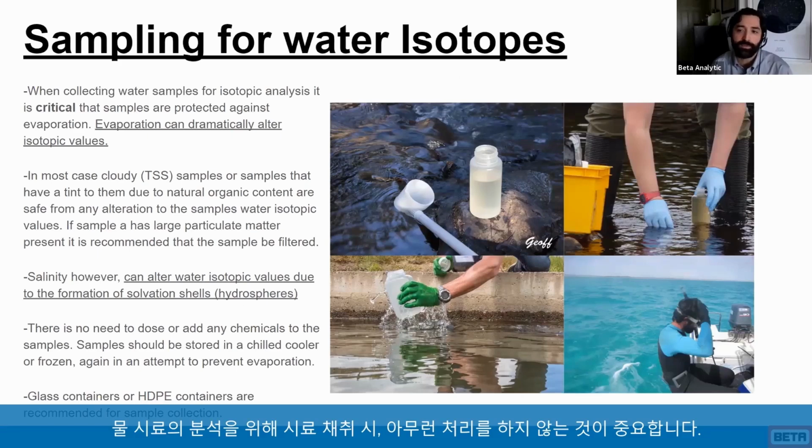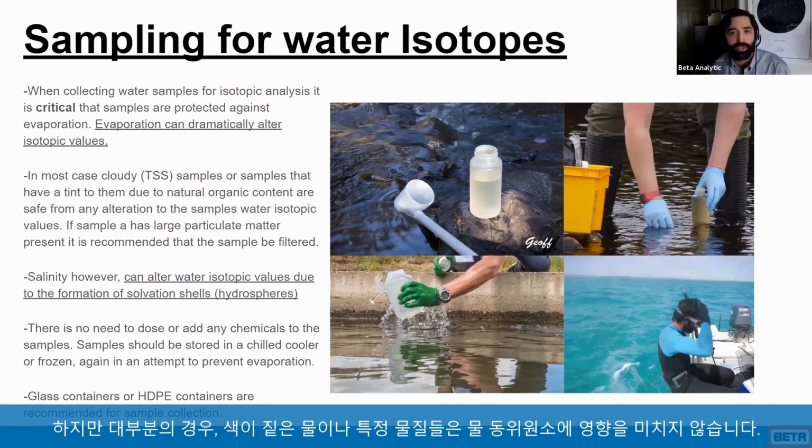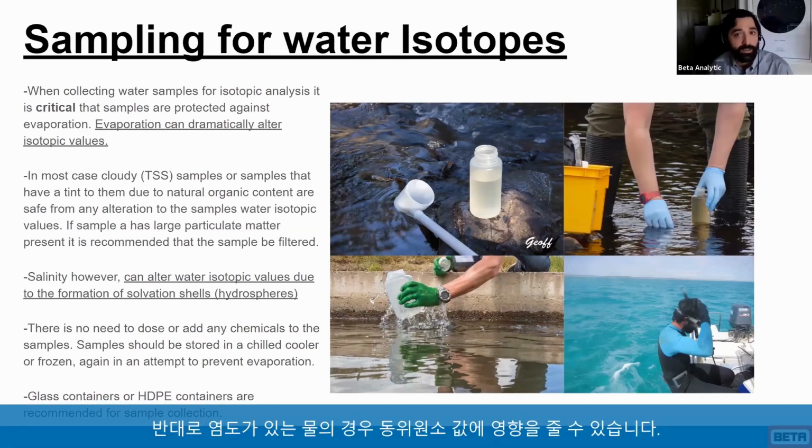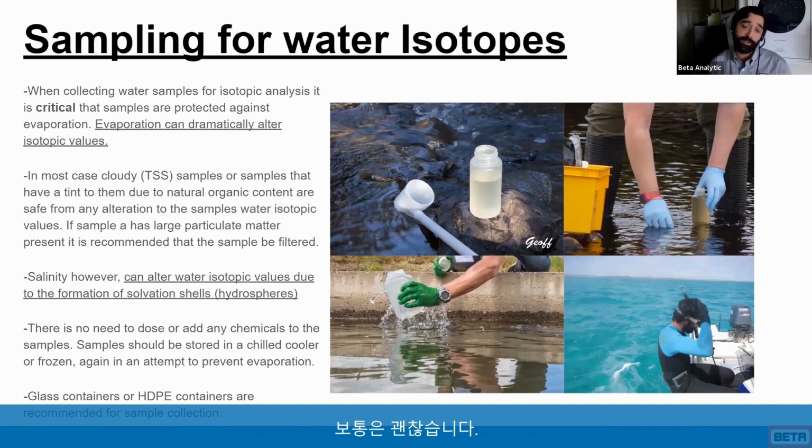When we collect samples for water analysis, it's really important that we leave them untreated. We do suggest that if there are suspended solids, you filter it to remove those solids, but in many cases, tannin-rich water or even particulate matter doesn't usually affect the water isotopes in any appreciable manner. Now, salinity, on the other hand, can create what are referred to as solvation shells or hydration spheres, and that can dramatically alter delta values. However, in most cases, if it's brackish or seawater, you want to record the impact that salinity is having on the delta value, so that's usually okay.